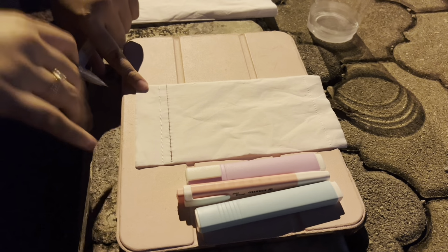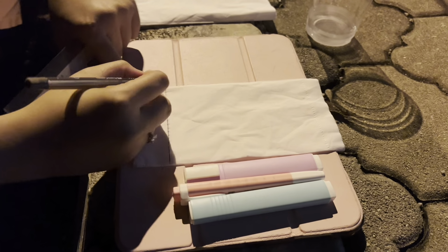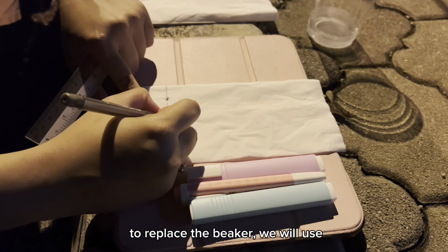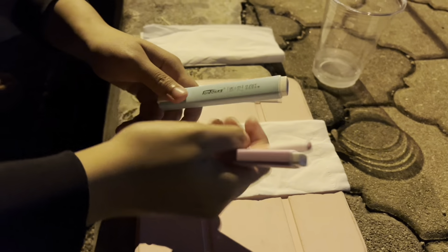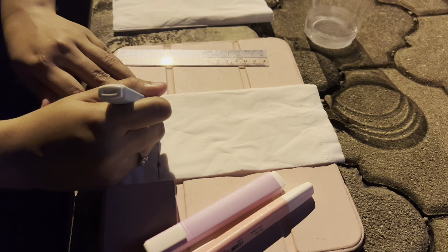And then I will put 3 marks because we will use 3 colors for this experiment. For the compound, we will use purple, pink and green. I will put each color on each mark.